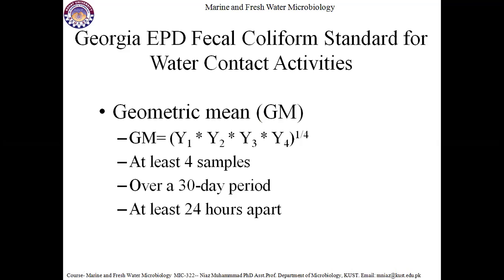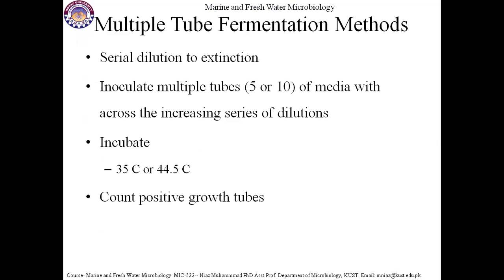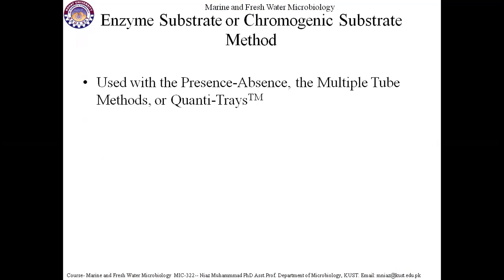So these were two techniques. These are the three techniques which we have studied: MPN, membrane filter technique, and enzyme-based technique. So the enzyme-based technique can be used for the field analysis of water.